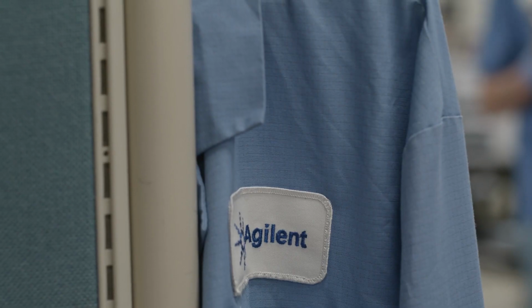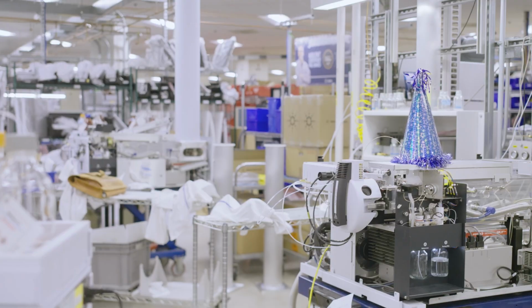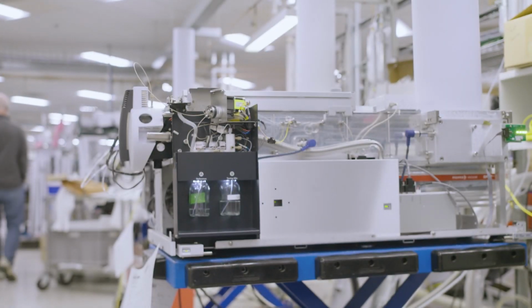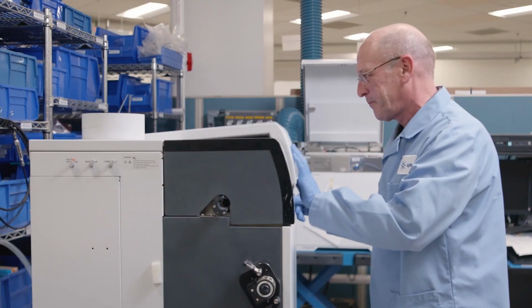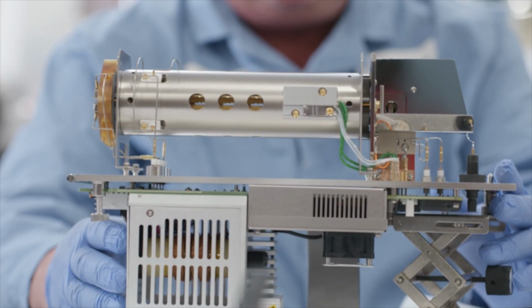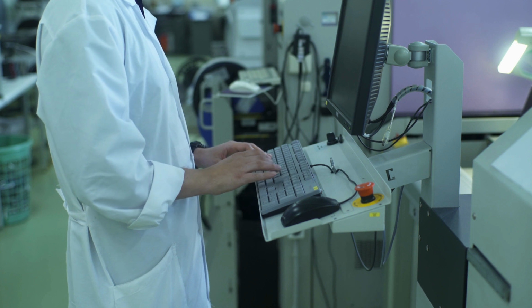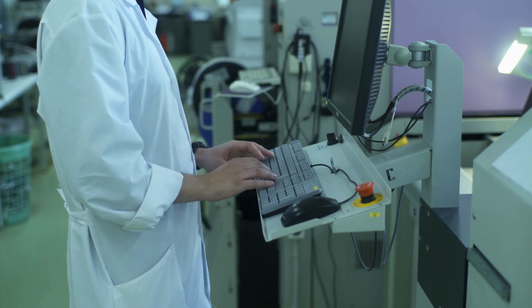This semester, we were tasked with working with Agilent Technologies, a global biotech company, to create a life cycle assessment for their new and refurbished gas chromatography instrumentation. Gas chromatography is an experimental technique used to separate and then further identify chemical components of a sample mixture. Agilent's goal for this project was to use these assessments to quantify the carbon emissions between new and refurbished instruments.